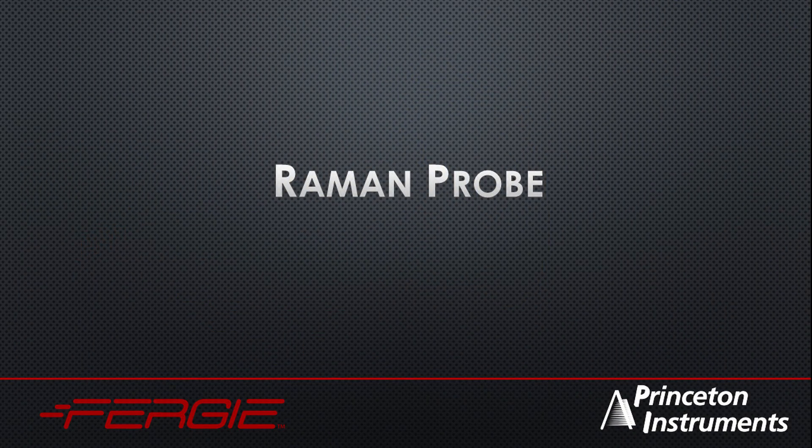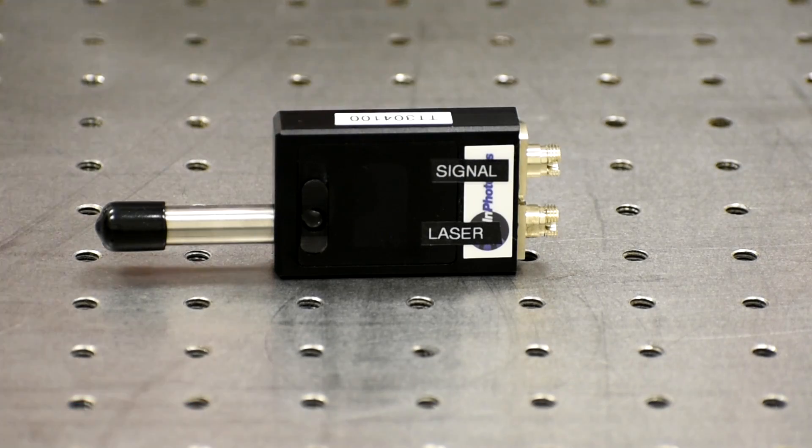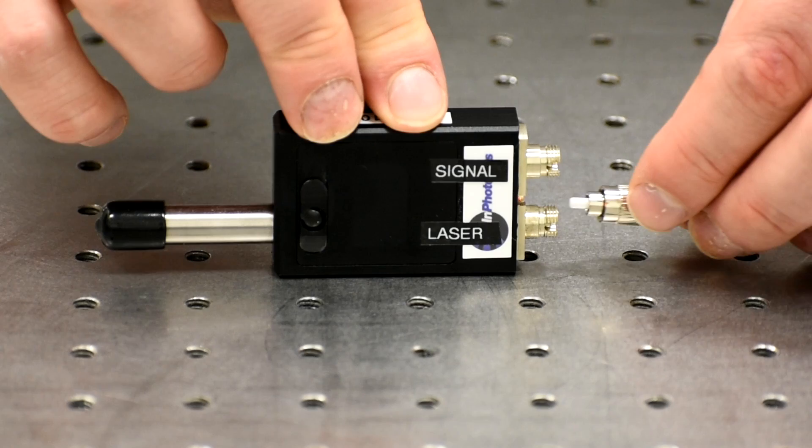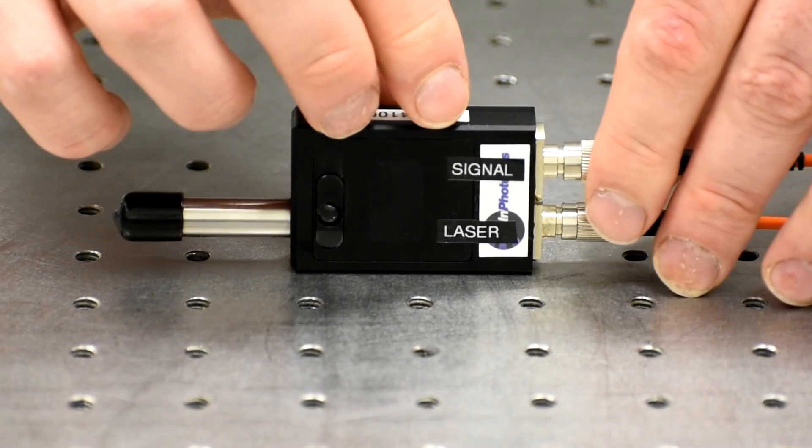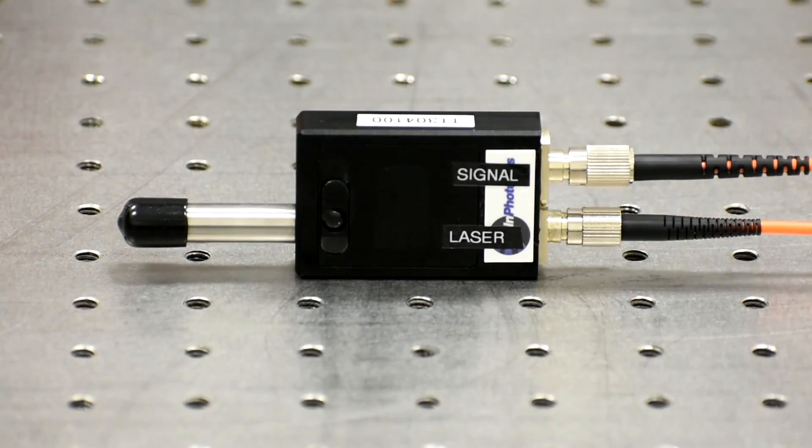Let's set up a Raman experiment with the fiber coupled Raman probe. Connect a fiber or fiber bundle from Fergie to the signal port of the probe. Then connect the fiber from the laser to the second input port.